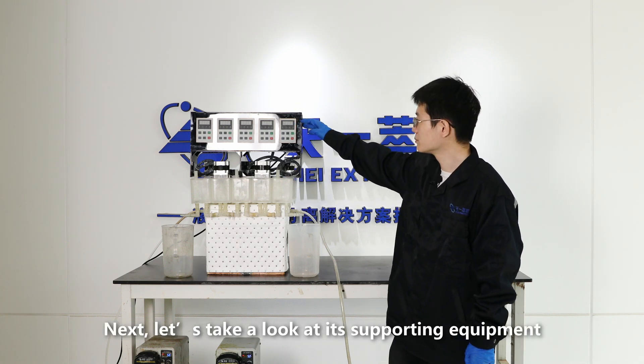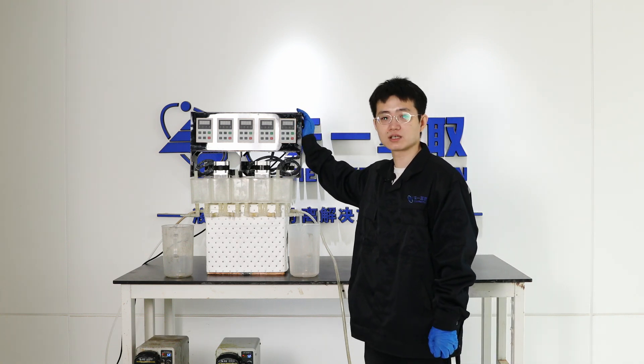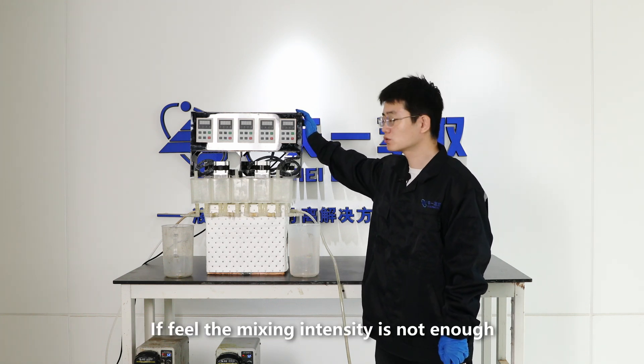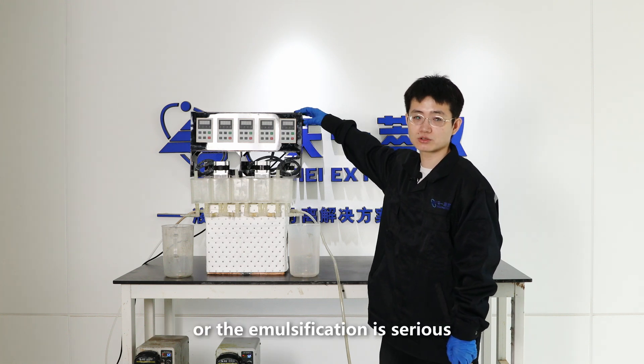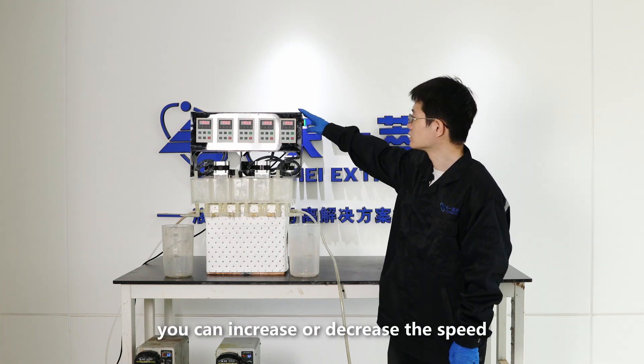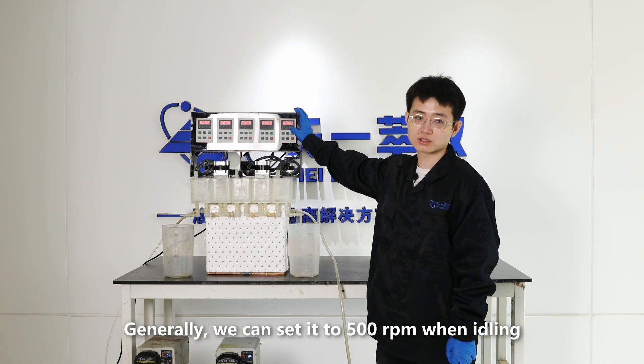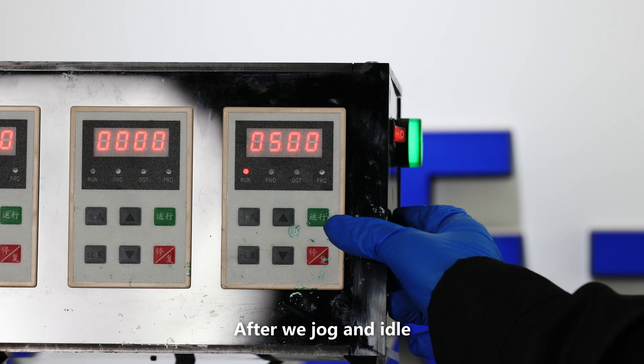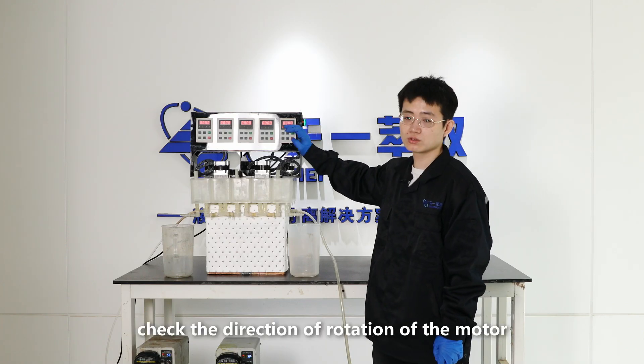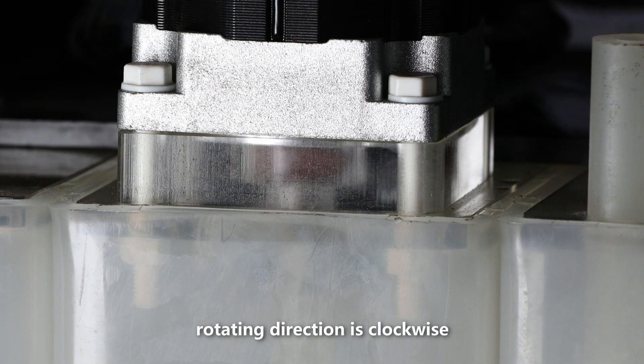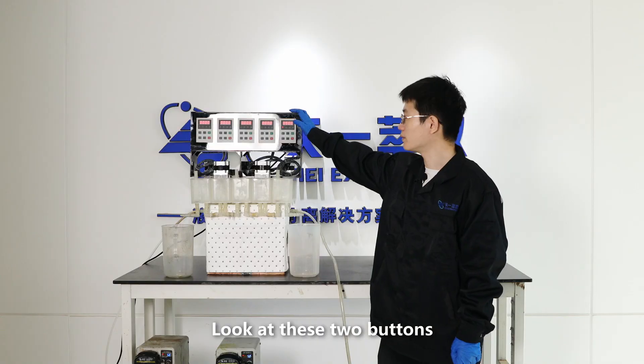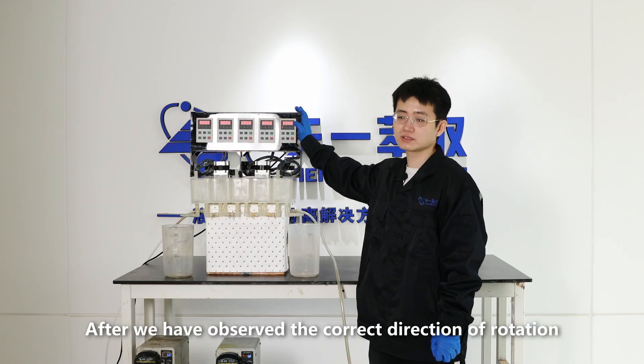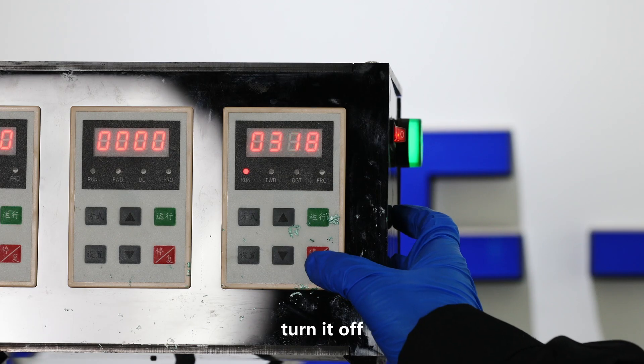Next, let's take a look at its supporting equipment. This is the speed regulator, which is used to control the speed of the mixing impeller. If field and mixing intensity is not enough, or the emulsification is serious, you can increase or decrease the speed. Generally, we can set it to 500 revolutions per minute when idling. The green one is the switch. After we jog and idle, check the direction of rotation of the motor. Rotating direction is clockwise. Look at these two buttons. They are used to adjust the speed. After we have observed the correct rotating direction, turn it off.